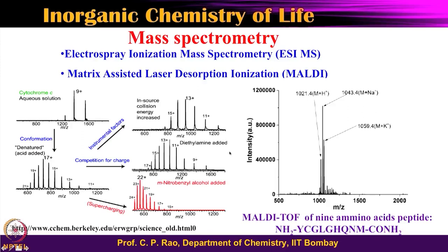So what do we understand from this? We understand that a protein has side chains. You have seen carboxylic groups, phenolic groups, amine groups, amide moieties, many kinds of groups. On these groups, imidazole is also there, you can either add a proton or remove a proton. When you add a proton, you are adding one mass and plus one charge.